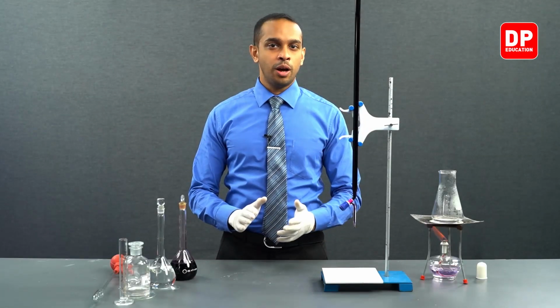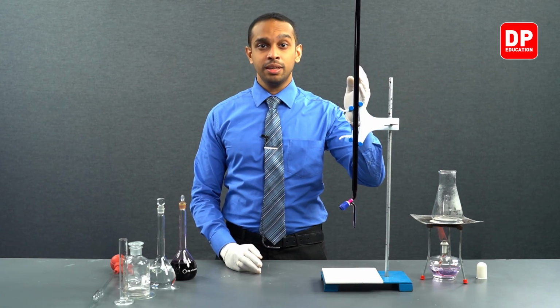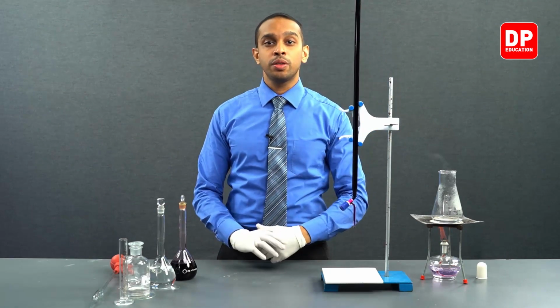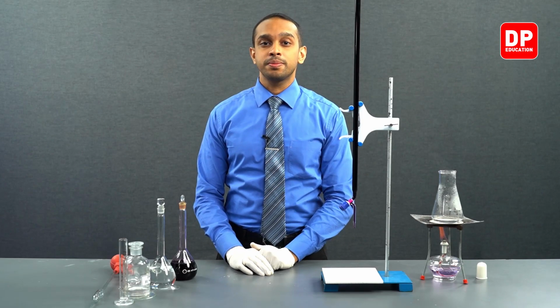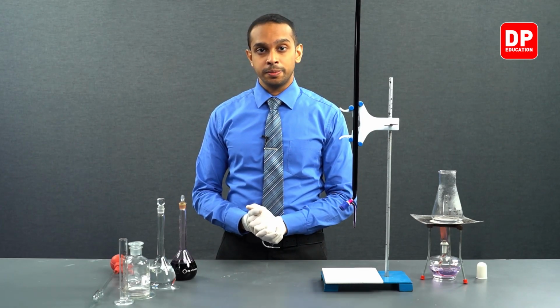Students, now we have washed this burette with distilled water and the potassium permanganate solution, and we have filled it up to the zero line in the burette. So now we can move on to our titration.